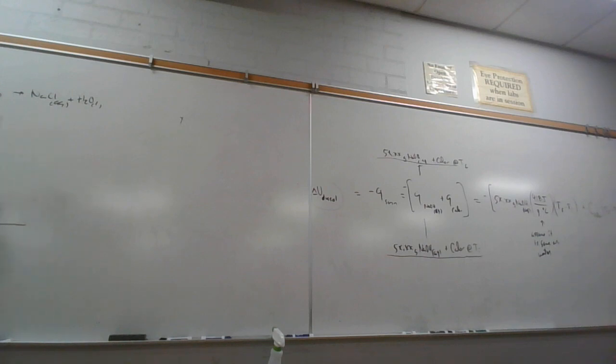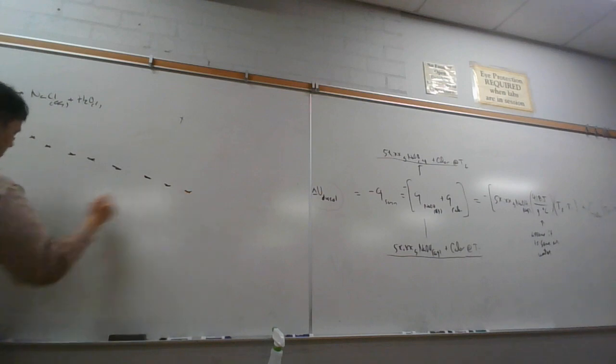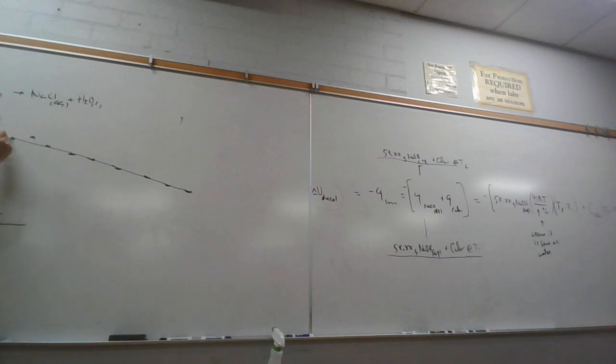And then we extrapolate that out to 6 minutes to get the T cold or T initial. And then we dissolve the sodium hydroxide, that releases energy, and then the sodium hydroxide reacts with HCl, that also releases energy. And so the temperature is going to increase. But initially, it might not be well mixed. And so we'll wait for a nice cooling curve or cooling trend here. And then we'll back extrapolate this out over here.